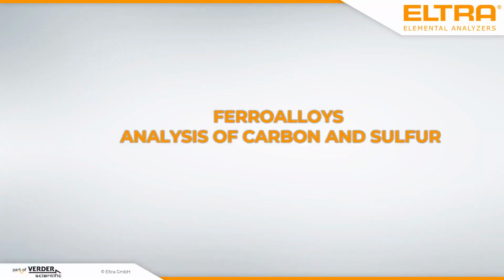Combustion or inert gas fusion analyzers are always specialists for, I would say, a special element. This means on the one hand you have carbon sulfur analyzers, and on the other hand you have oxygen, nitrogen, and hydrogen analyzers. So this is the reason why we start with carbon and sulfur analysis in ferroalloys.